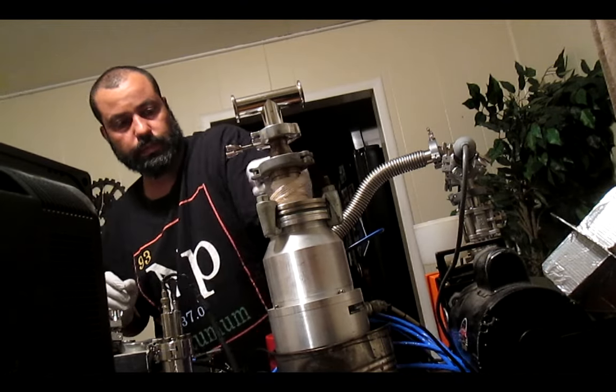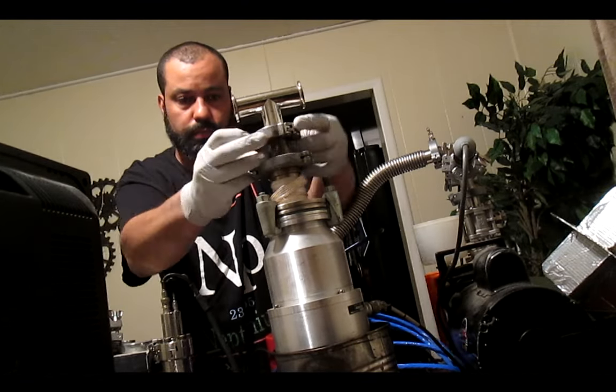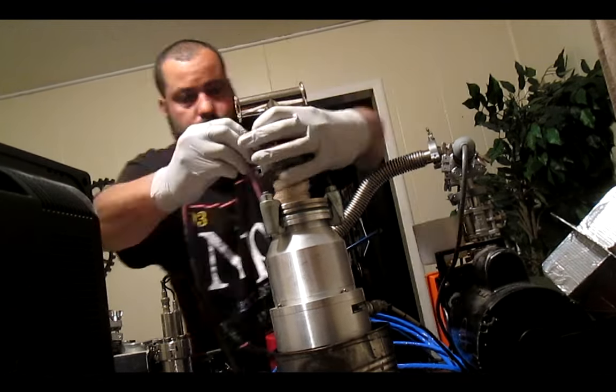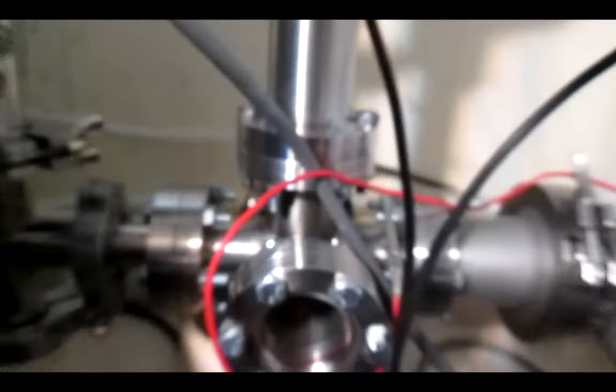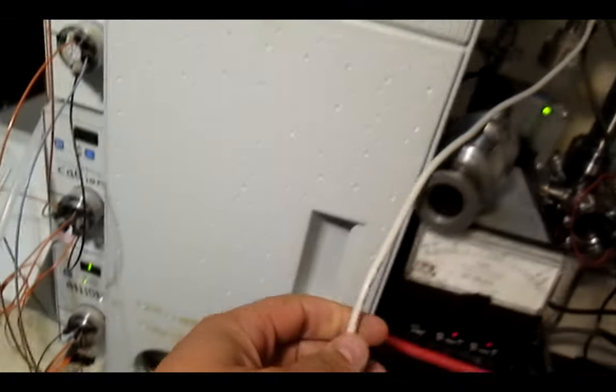This device is said to be a standalone analyzer, and if you want to use it as an analytical instrument, you'll have to set up your own injection method.